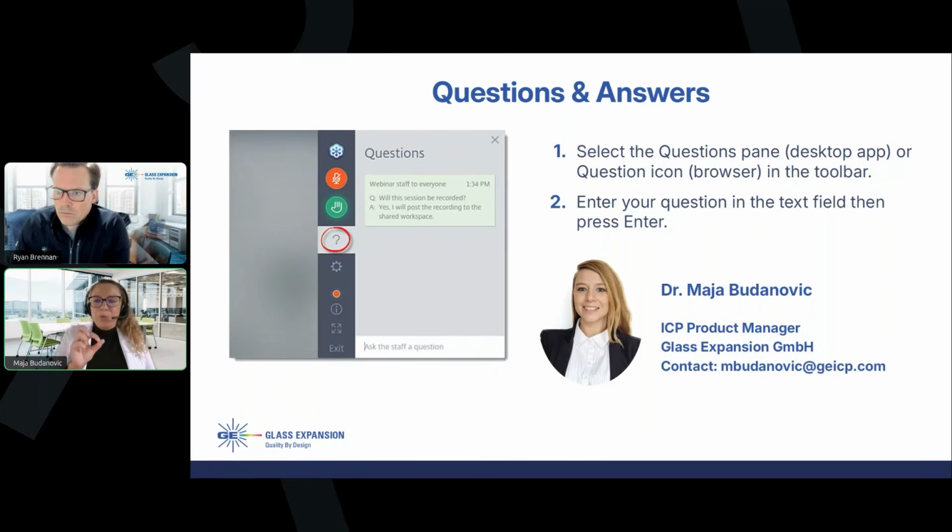So what you can do is check, maybe inspect it with a magnifier to see where exactly the blockage happened in that sample line that is connected to the sample probe. If it's at the end, maybe it can be removed by cutting, or if it's at the beginning, closer to the sample probe, you can simply replace it if you have a Guardian probe to use these interchangeable lines.